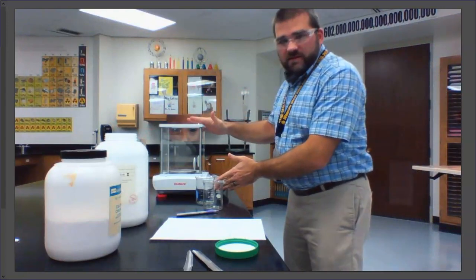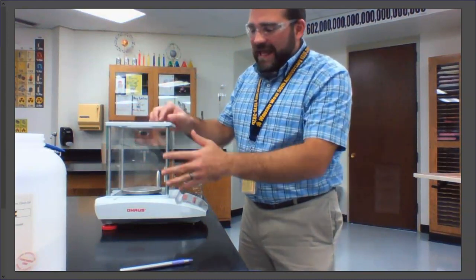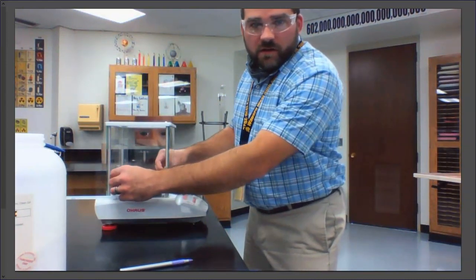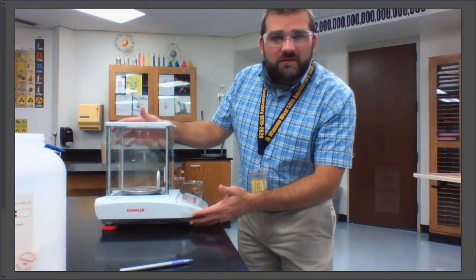So this little balance over here, and I'll get a little bit closer. Sorry for the shaky cam. This is what's known as an analytical balance. It has this cage around it with sliding doors to guard against the currents or the air in the room. This goes all the way down to the thousandth place. This is way better than any balance you used last year in regular chem. This thing is over $1,000. It's an expensive piece of lab equipment, and it's specifically only for AP Chem because it's so expensive.